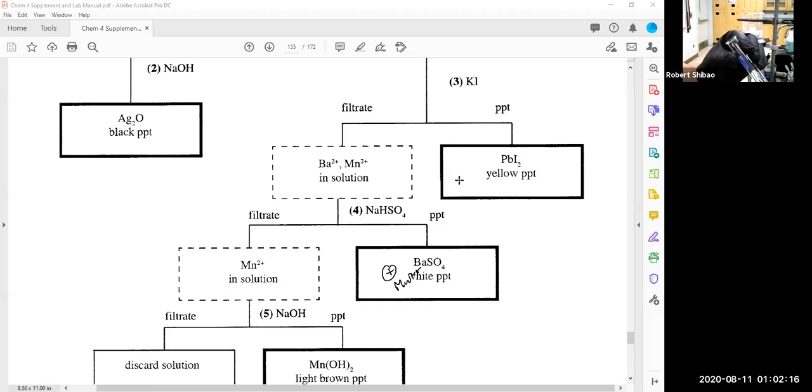So the sulfate test for unknown B, I'm just going to use 1 squirt of unknown, and then I'm going to use a squirt of barium nitrate. Okay, so nothing happened. So unknown B came out negative for sulfate. So unknown B only has nitrate so far.